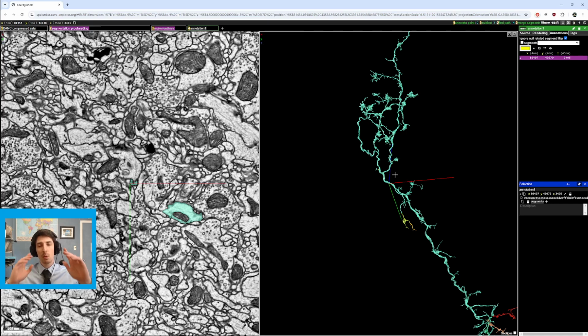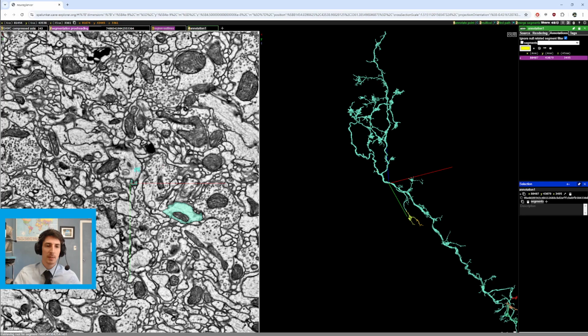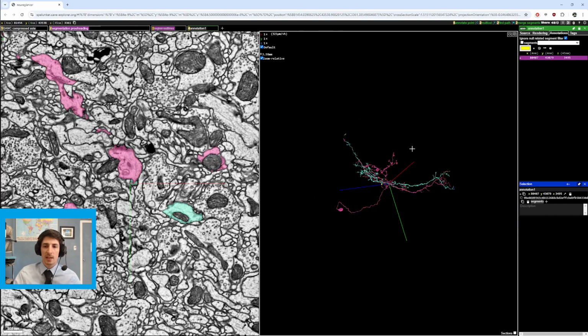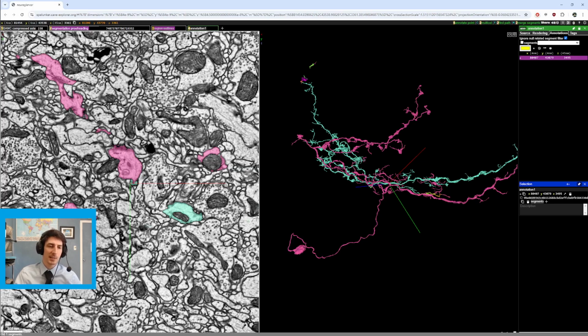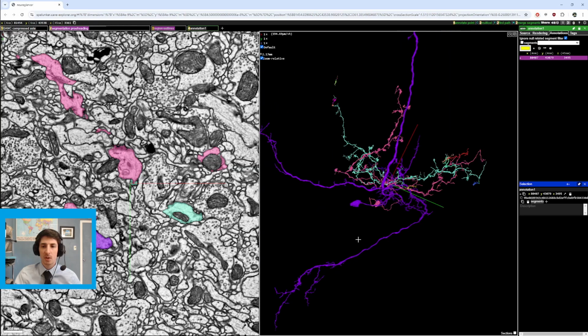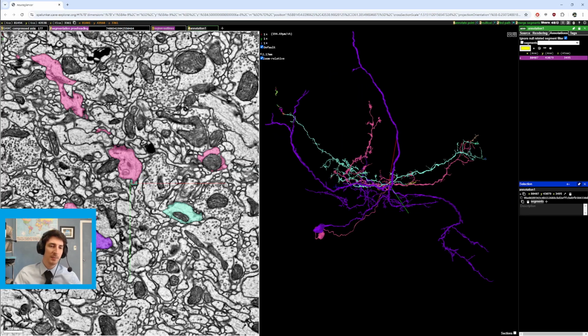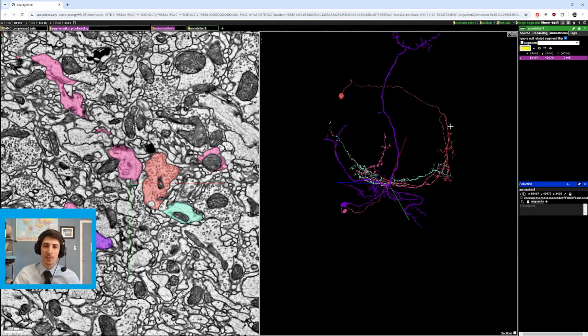And one thing you're going to notice once you've done a lot of cells, or when you see a lot of cells that have somas, like say we click this, I don't know if this one has a soma, but we could pull it up to check. So this is a soma down here. So this is another thing: pull up a cell nearby, see if it looks similar to the cell you have. Let's see if we can find a dissimilar cell actually. This is not that much of a similar cell. These examples aren't really working. So here we go. Here there's a soma over there.